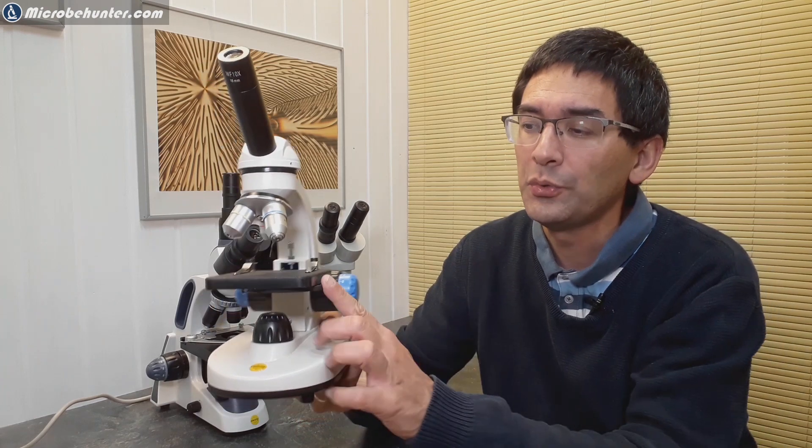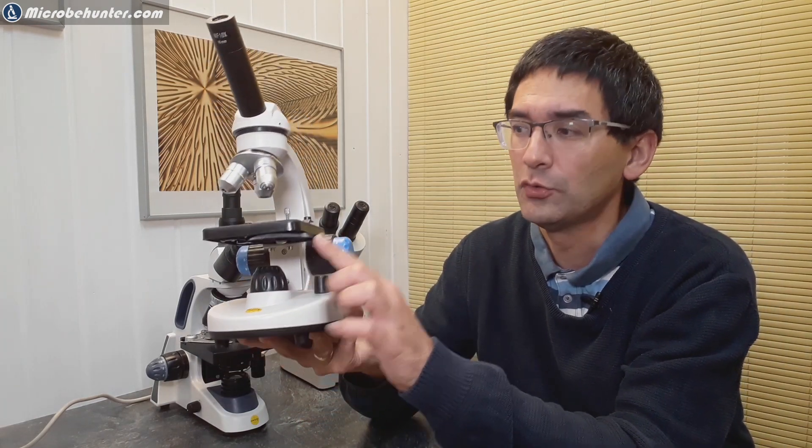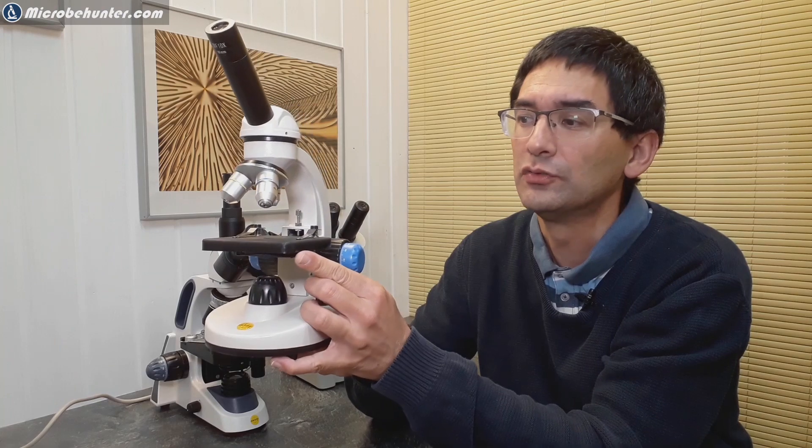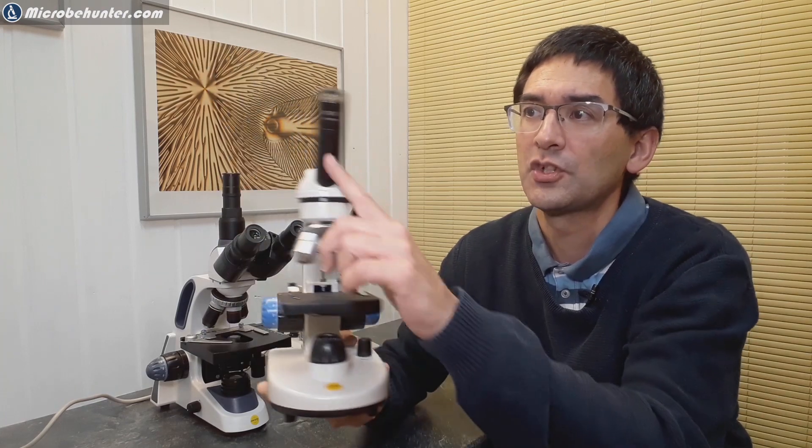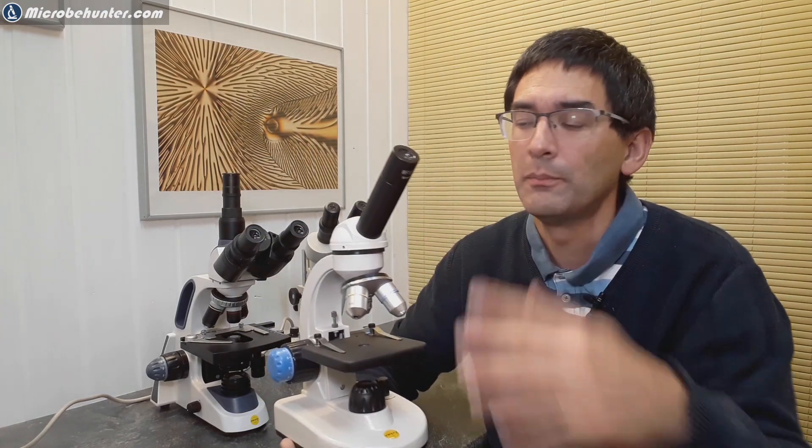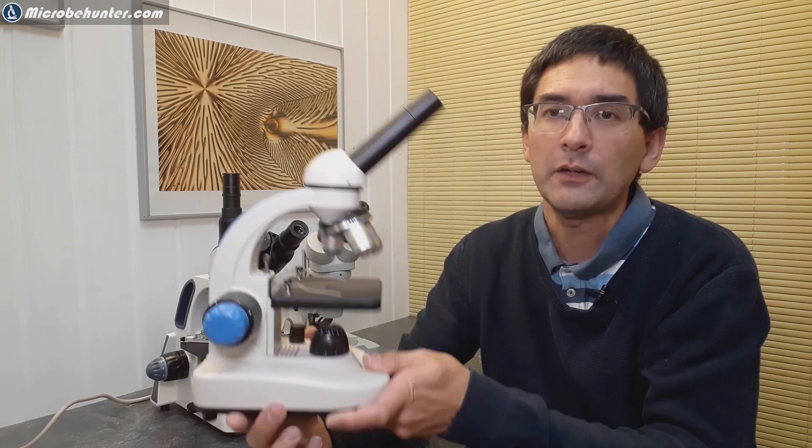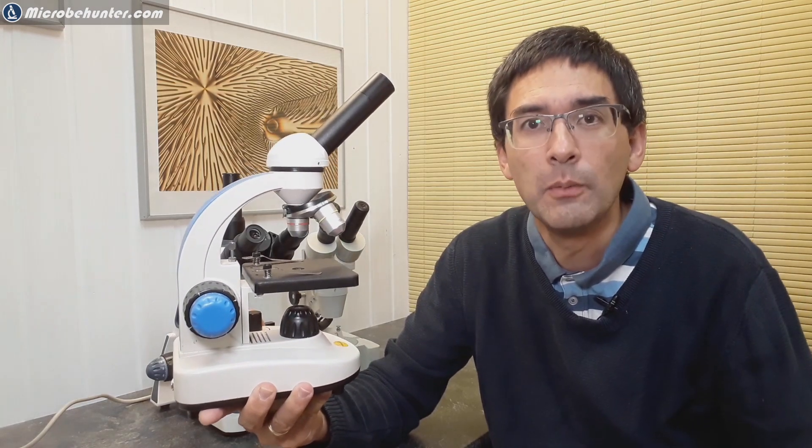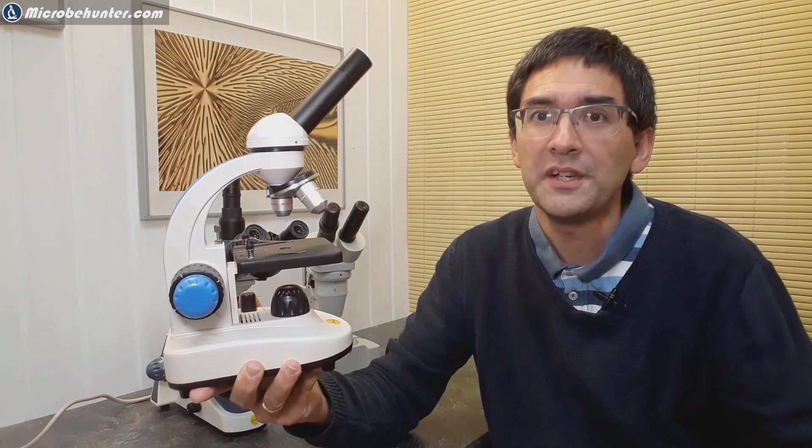But from a picture you might not be able to see the difference quite well, but you will notice that it does not have a real condenser here. There's only a disc that you can rotate, and there's of course also only one eyepiece so it's a monocular microscope. Now those introductory microscopes can be obtained already for maybe 70, 80, maybe maximum of around 100 euros or dollars, and for their price they're quite nice and they're also suitable for children, for field microscopes, and many people actually tried out microscopy by buying those microscopes and they're fine for the cost.